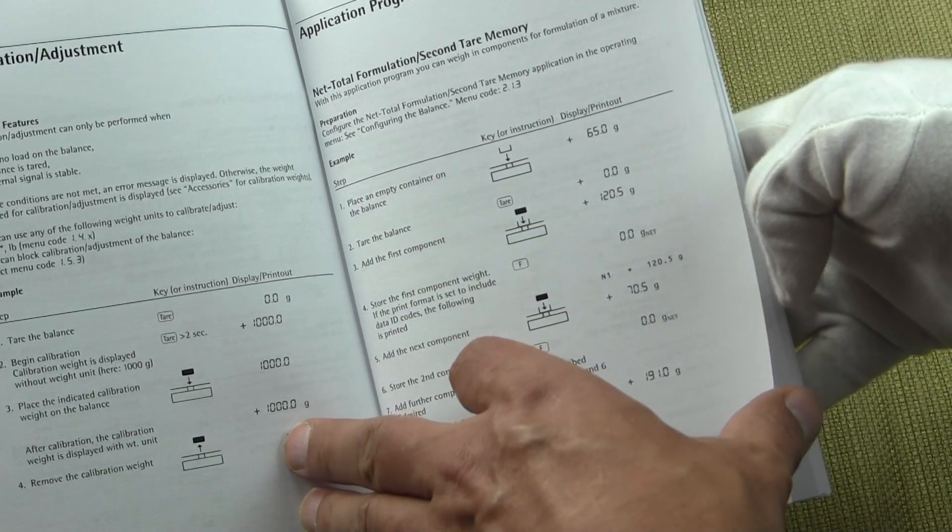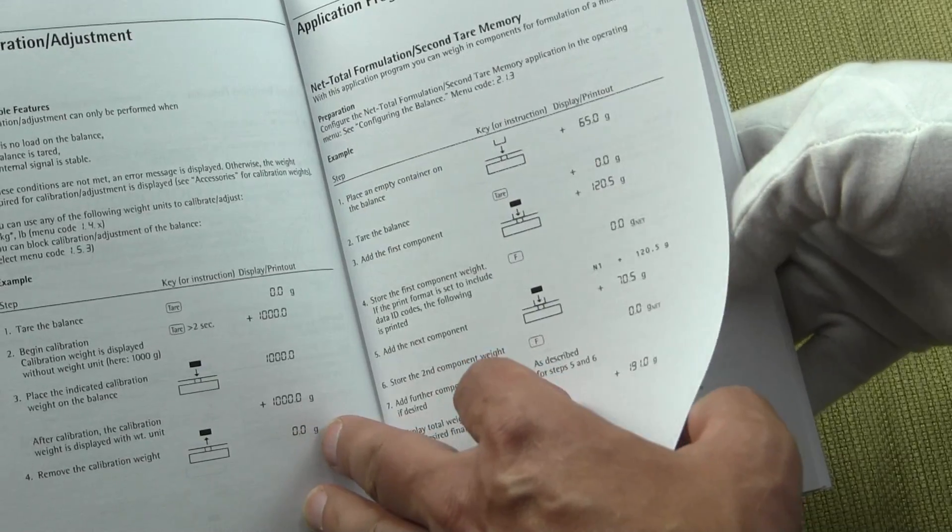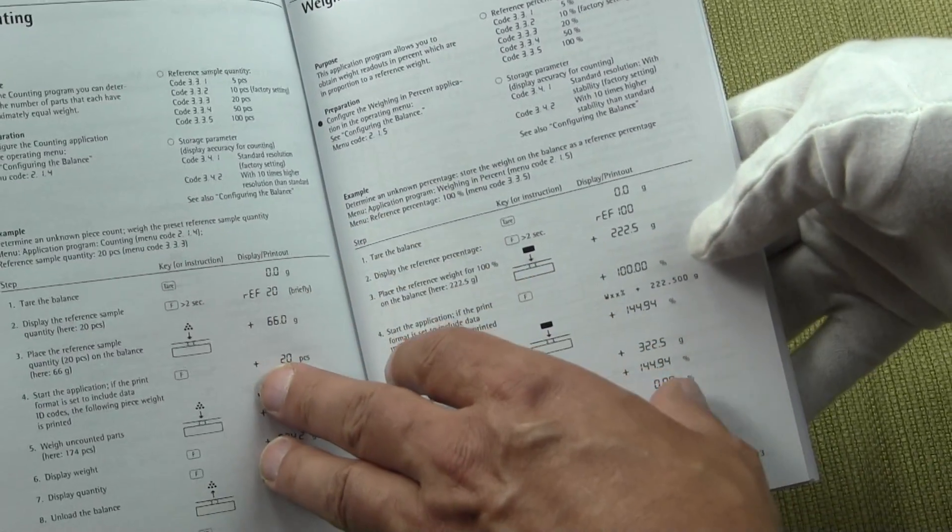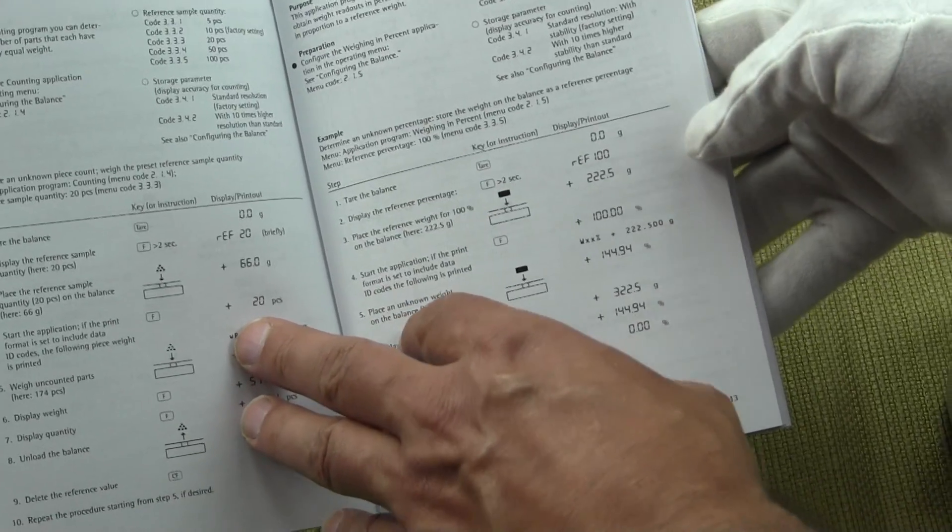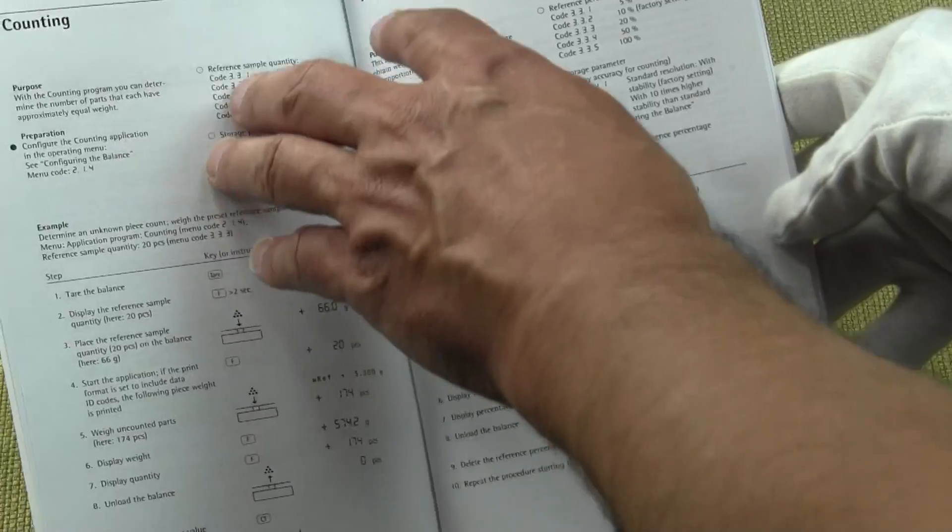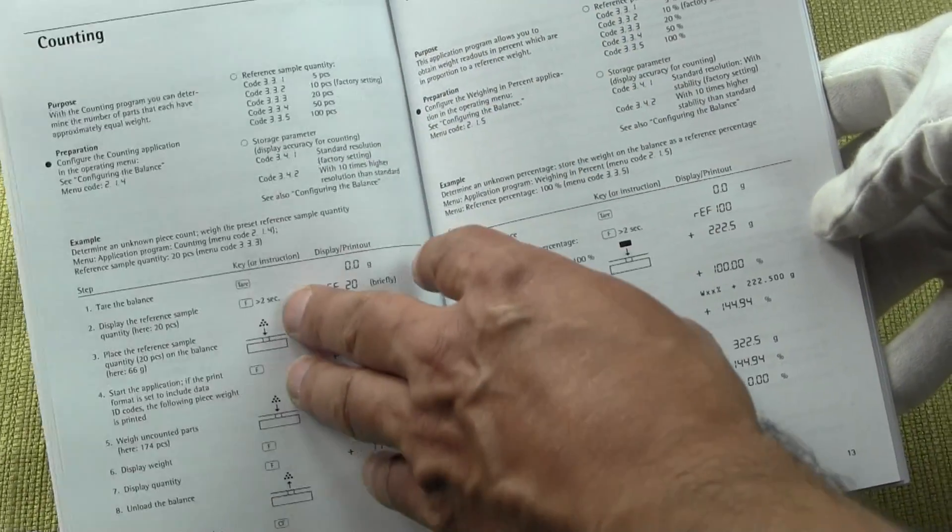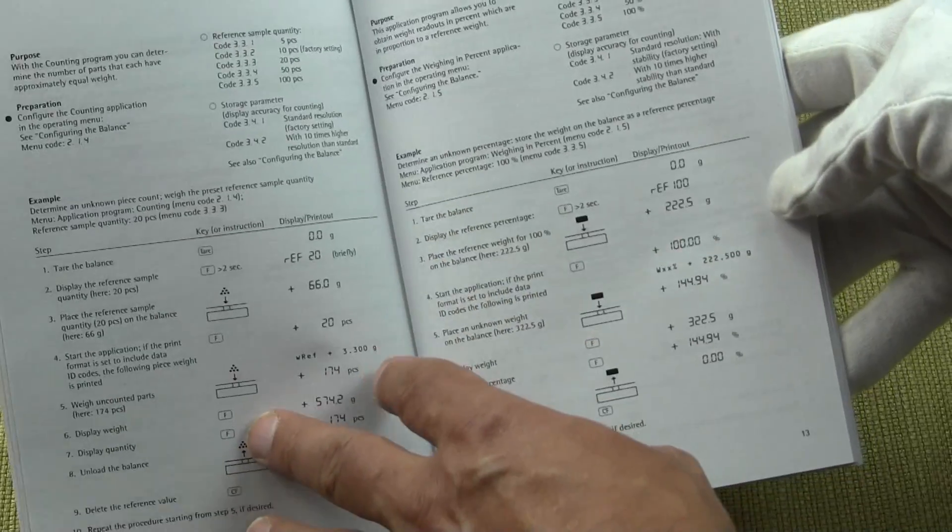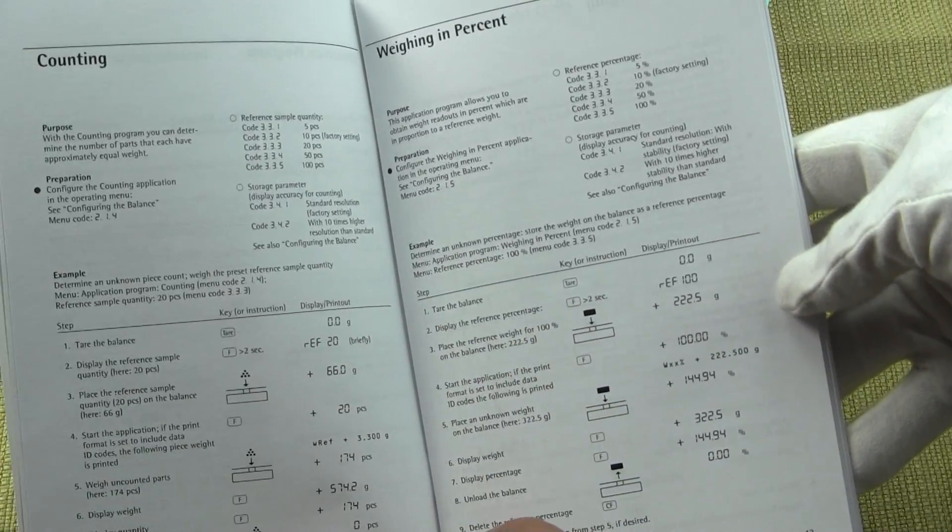So it's extremely easy. Some balance manufacturers out there have their manuals so hard to configure because their goal is to have you sign up for a service contract. As you can see, Sartorius' manual is self-explanatory, giving you all the reference codes for configuring the balance and step-by-step instructions.